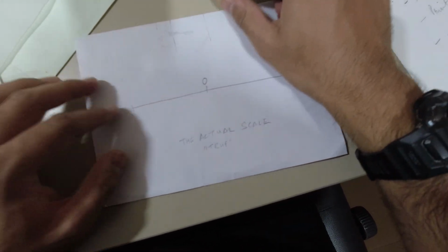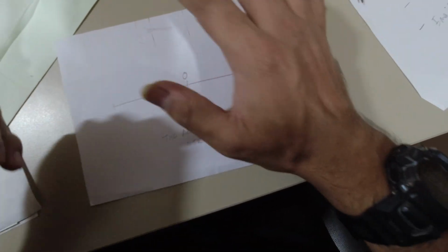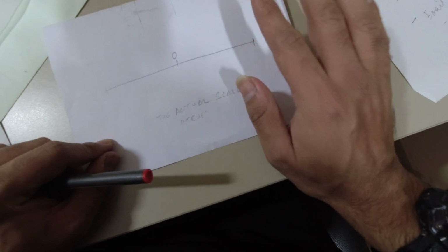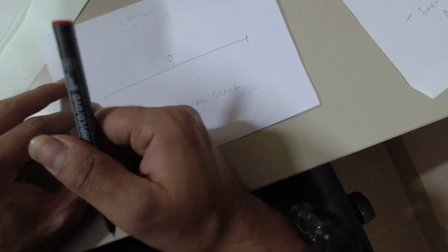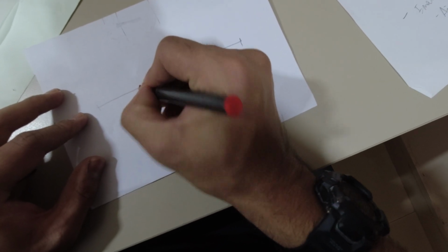Hi, I just thought I'd do a quick video demonstration of what I've understood the linearity correction to be. So let's say this is the actual scale, the actual true isotopic scale, and there's one particular standard, I'm just going to put that in red color. Let's say that's over here.